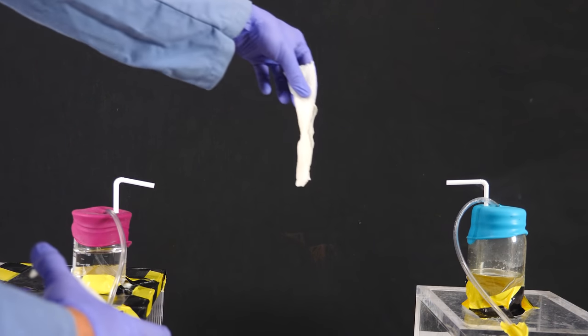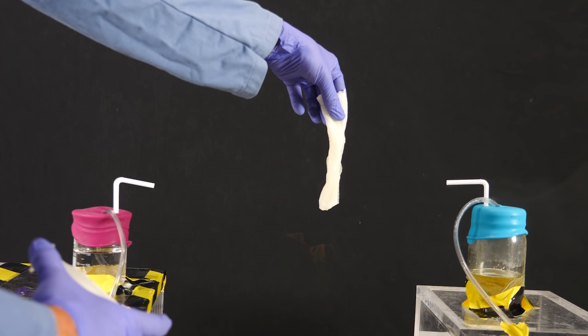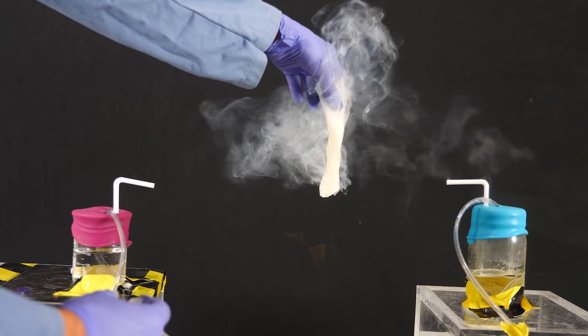You can also just put the ammonia on a cloth near the hydrogen chloride, and you'll get the same type of fuming.